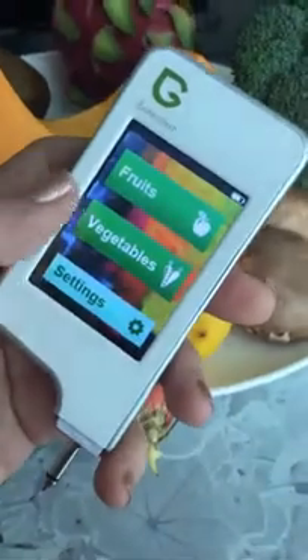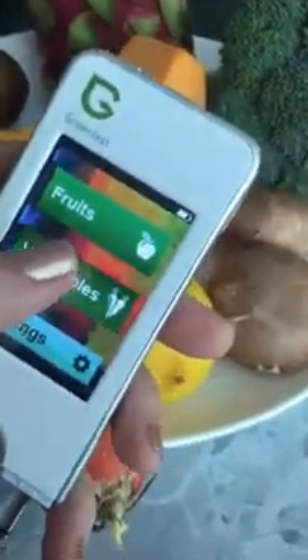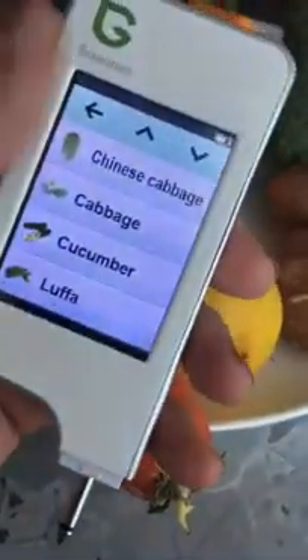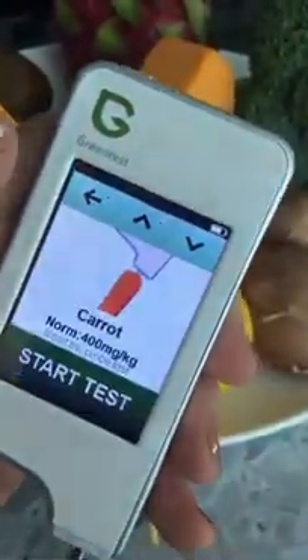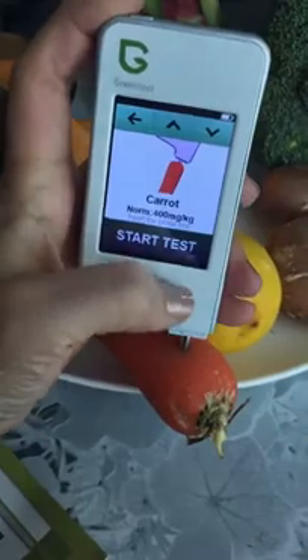How this works is that they have predetermined a list of fruit and vegetables. As you can see I've got a variety in front of me and I'm curious to test. When you hit the vegetables section, there's a list. Let's try carrots first — let's look for carrot. There we go, carrot. I'll hit carrot and put the probe in. Bear with me doing this one-handed.